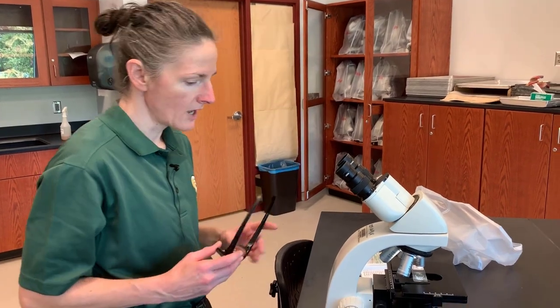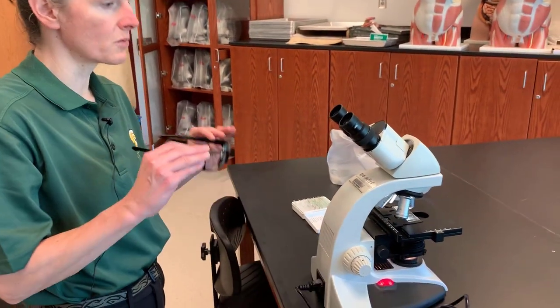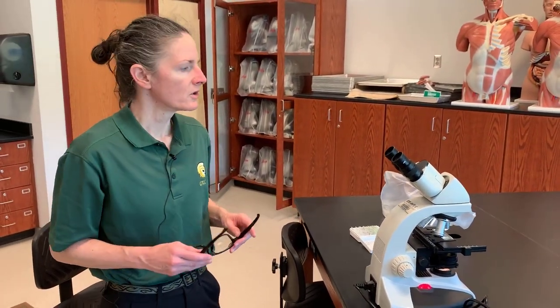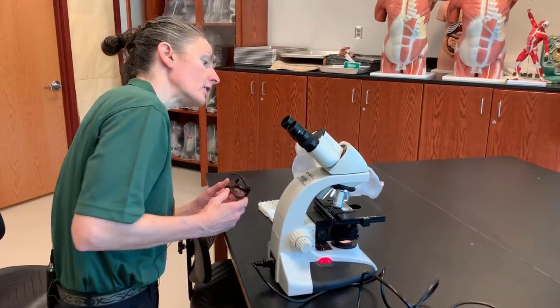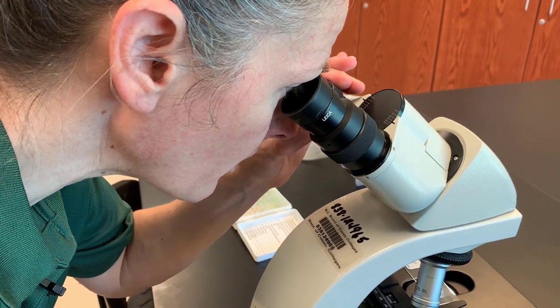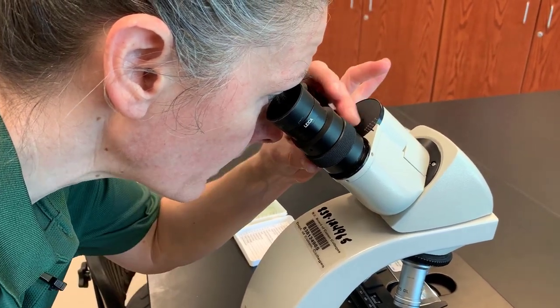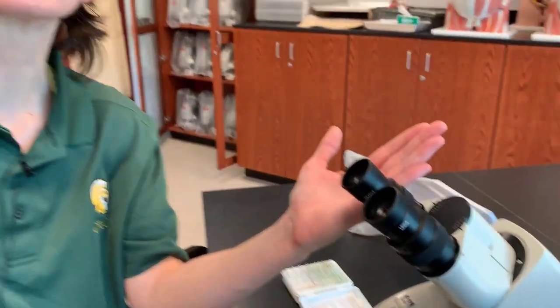Another thing about these microscopes is that a lot of you will have different vision. If you are wearing glasses or contacts, your vision may be different from your partner's. You actually have a diopter setting on the ocular lenses that can help you determine what your correction will be. You can sort of add your correction into the lens by adjusting the diopter setting.